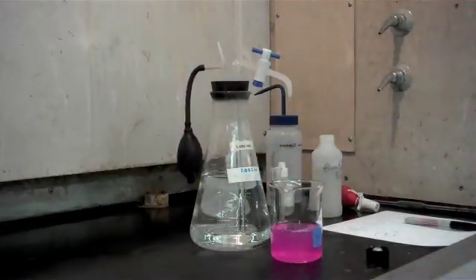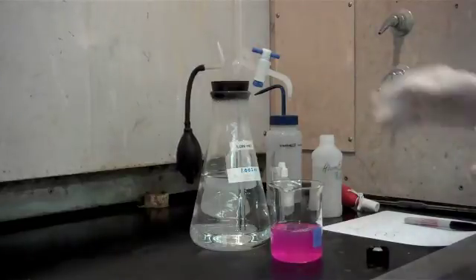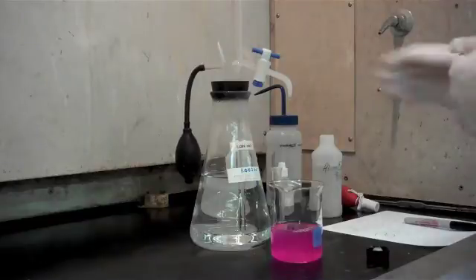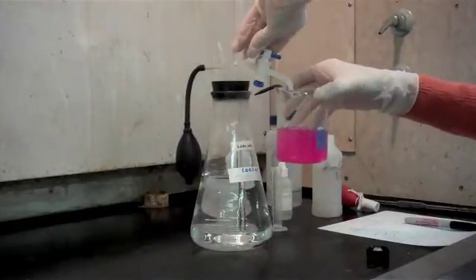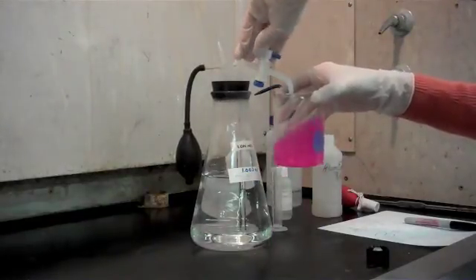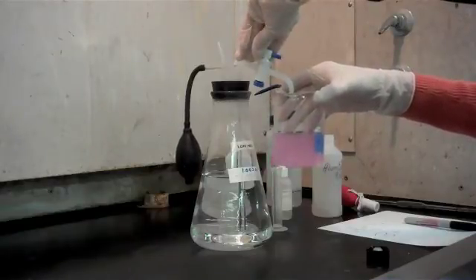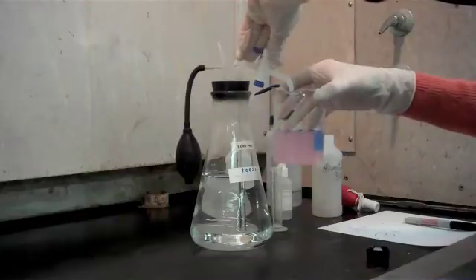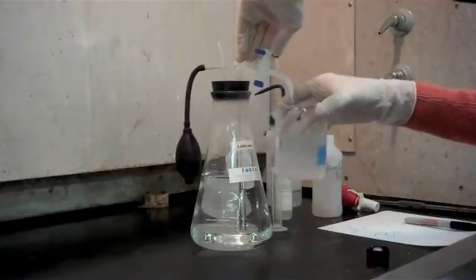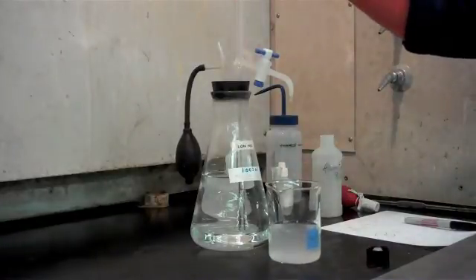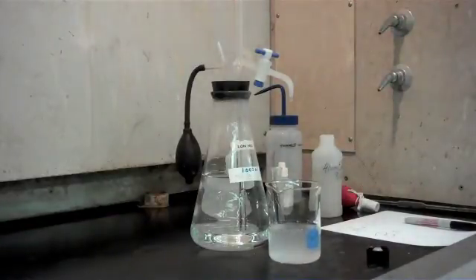What we're going to do with our zeroed out burette is titrate once again until that pink color disappears. And as you can see in this case, we used one and a half mils of hydrochloric acid.